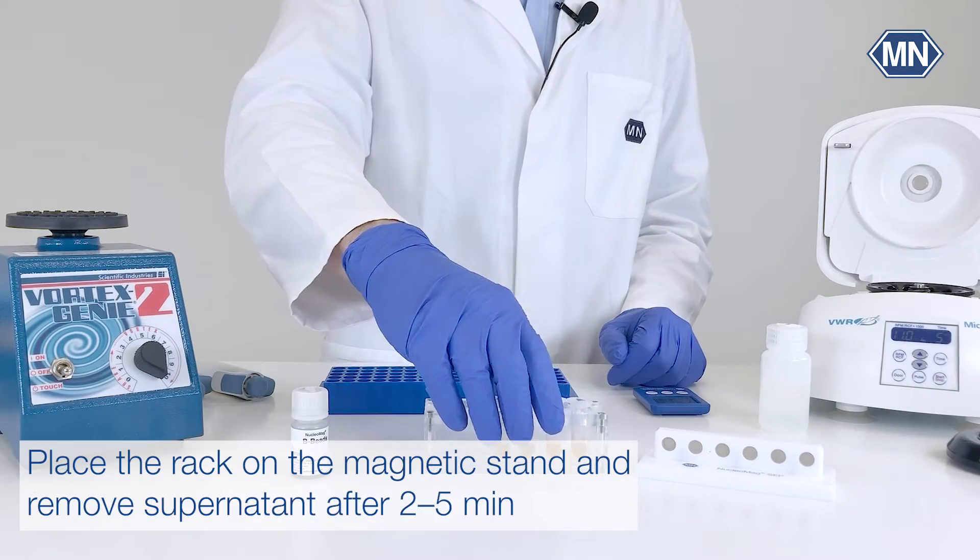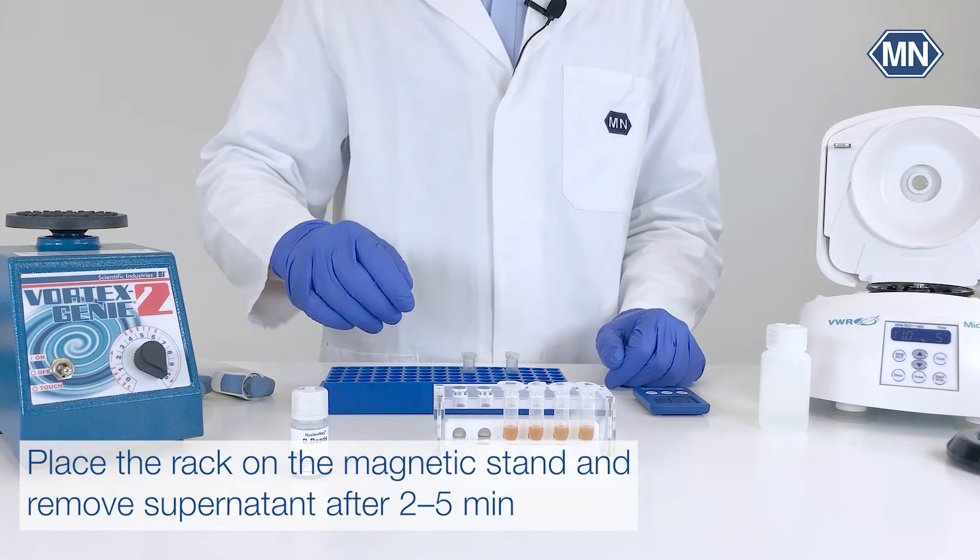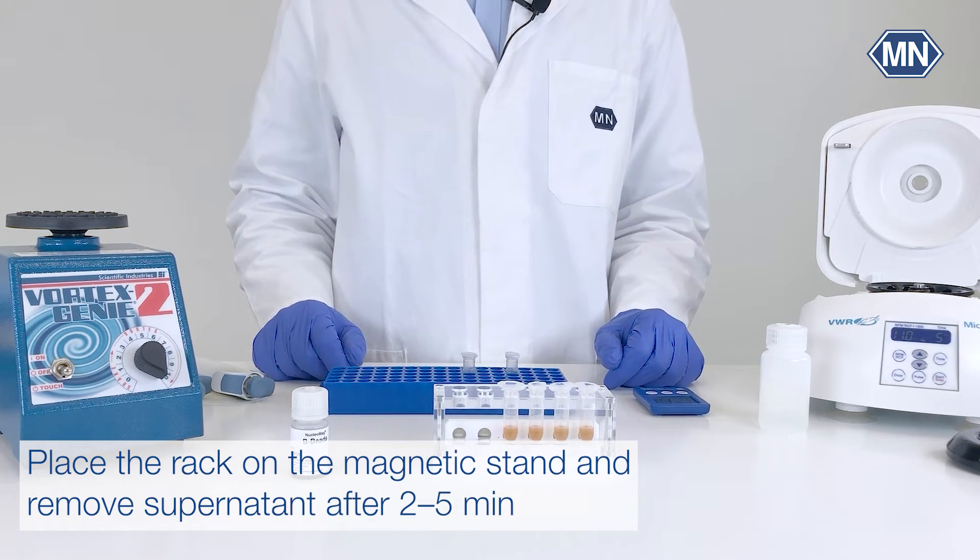Afterwards, place the rack of the Nucleomag ZEP Mini on the magnetic stand and remove the supernatant carefully after 2–5 minutes, until all the beads have been attracted to the magnet.